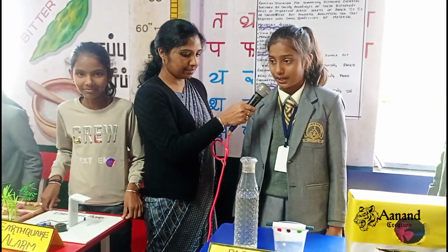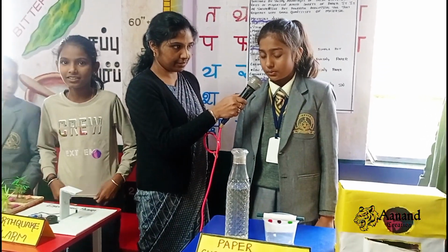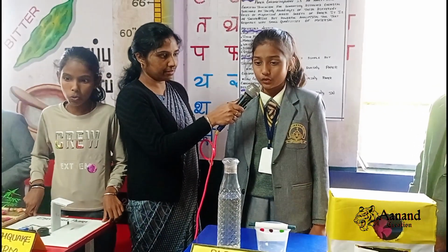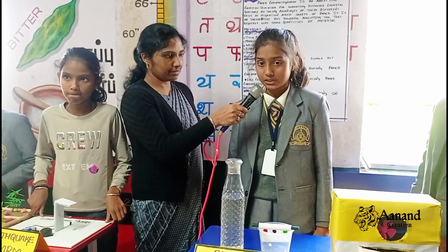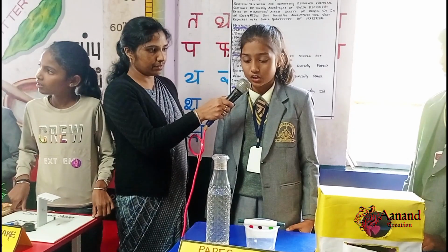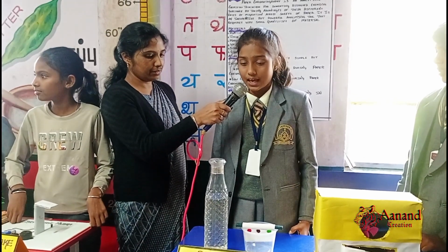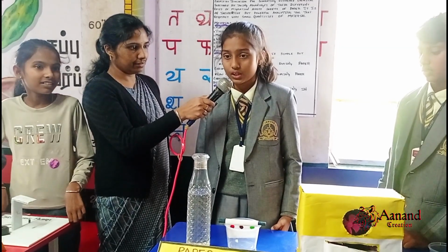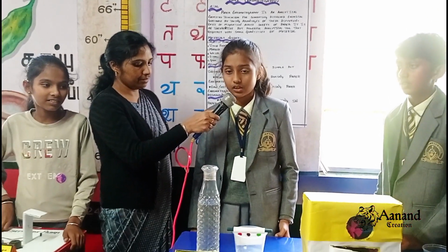I am here to explain about our science exhibition model. My topic is about paper chromatography. Paper chromatography is an analytical chemistry technique for separating soluble chemical substances by taking advantage of their different rates of migration across sheets of paper. It is an inexpensive but powerful analytical tool that requires very small quantities of material.